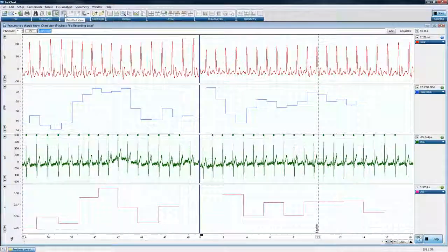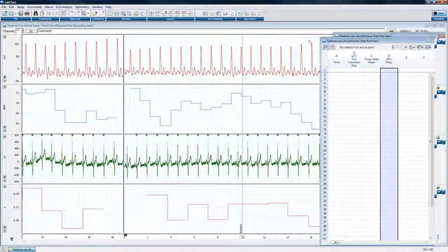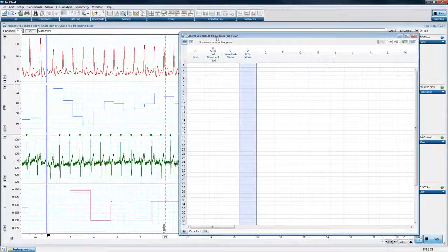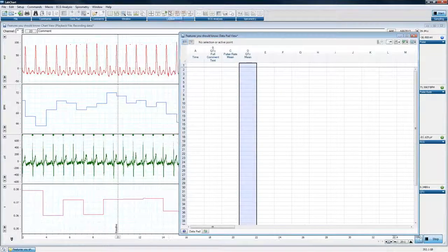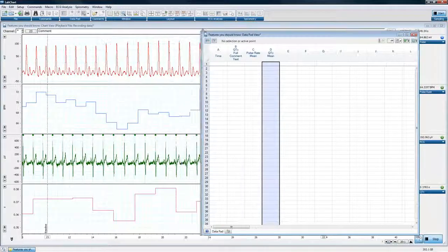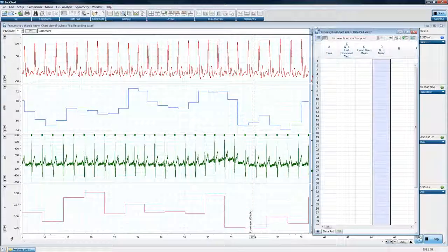So if I open up the datapad, and I can open up the datapad by going to the toolbar here, I'm going to do some analysis with the datapad. The datapad will open. You can see here as of right now it opens up over the top of my view. Okay, I'm going to show you 2 ways you can organize the way this looks. Now I already have my layout saved, but if I didn't have this layout saved yet, I'm going to show you the easiest way to make this organized. So there's 2 separate ways to do it.